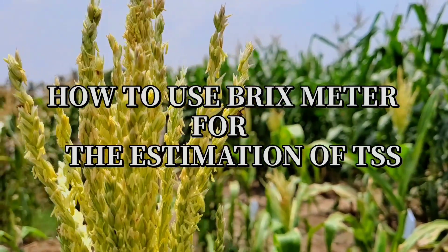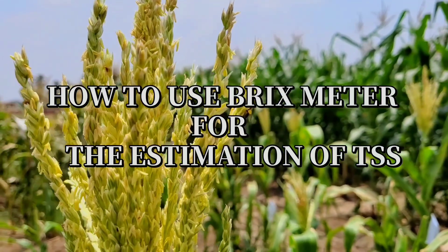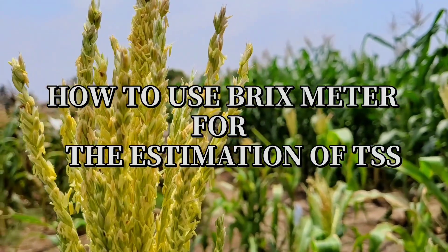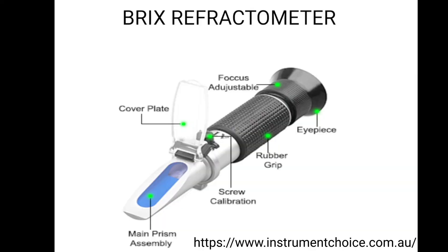In this video we are going to see how to use a Brix refractometer for the estimation of total soluble solids. A Brix refractometer is a device that measures refraction angles and converts the measurement into weight percentage of sucrose content, displayed as percentage in Brix.